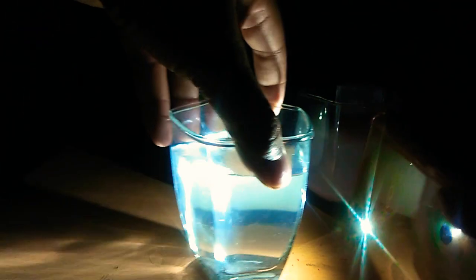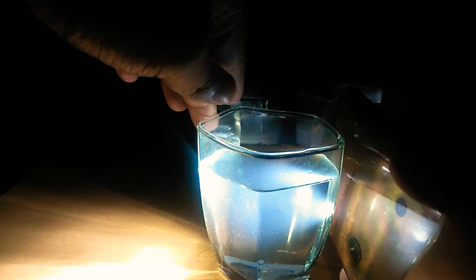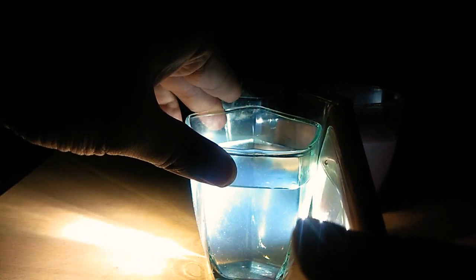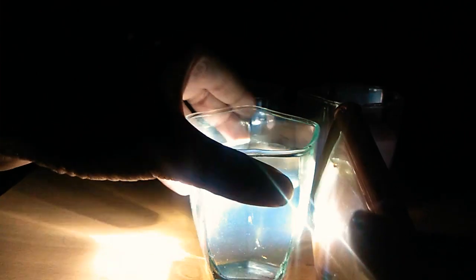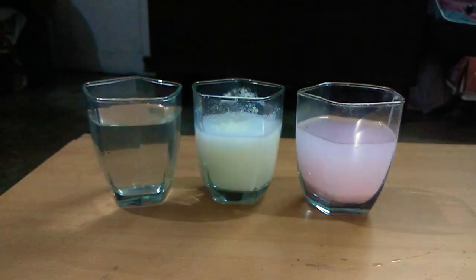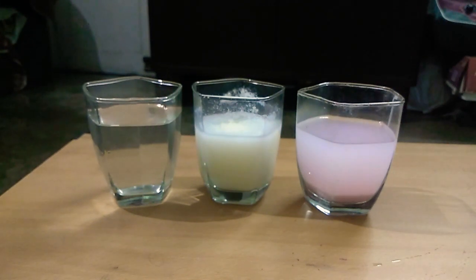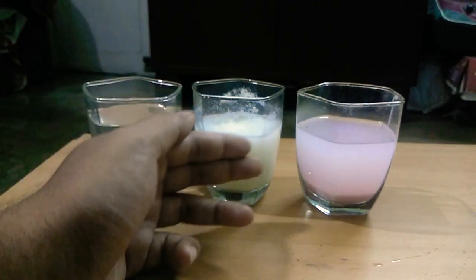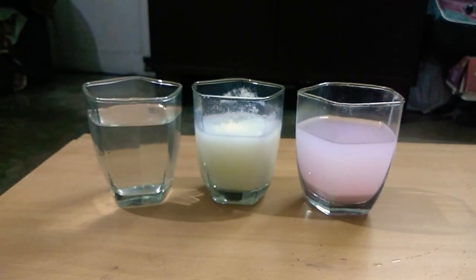But again I bring back the solution and you see the difference. The solution is absolutely clear. You cannot see that the solution is getting lighted up, just like in case of colloids or suspension. It is more nicely seen if you use a laser. So solutions do not cause scattering of light. Colloids and suspensions cause scattering of light. The last comparative property that we'll see is separation of the particles.